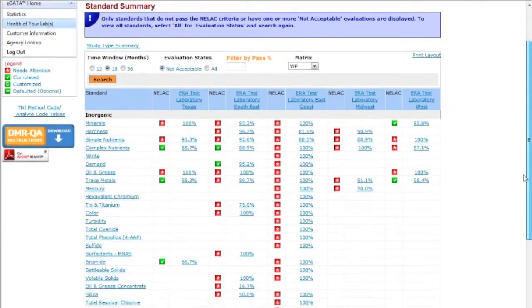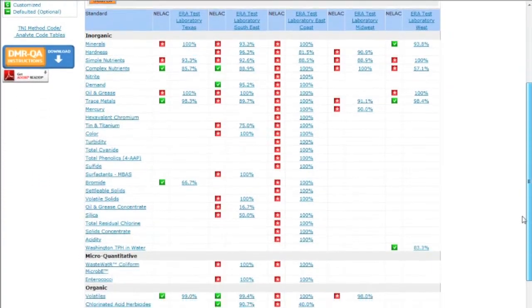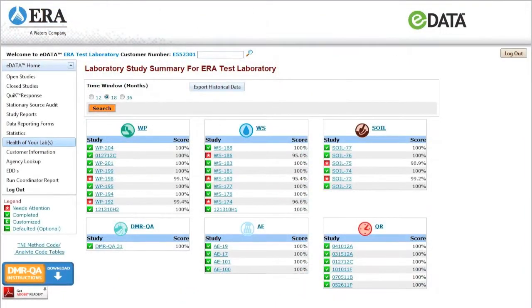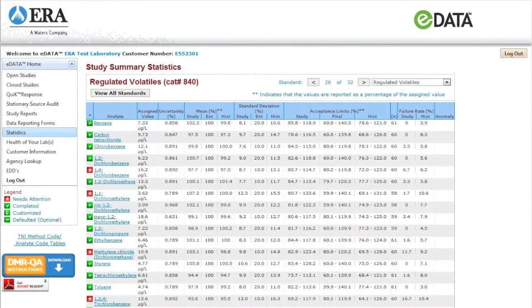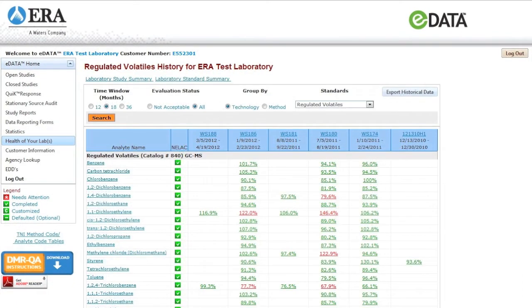Health of Your Lab also allows you to view results at the program level, or drill deeper to analyze data at the study level, the standard level, or the analyte level.